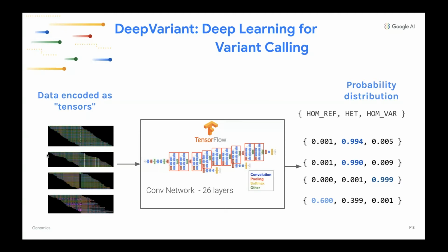and it takes not quite images of a genome browser, but things which are conceptually similar. So this is an ordering of genomic data with a left coordinate in the reference and a right coordinate in the reference. It's a composite of multiple channels: bases, qualities, mapping qualities, strands, and so on. So a human couldn't really meaningfully look at this data, but it's able to be processed in the same sort of architecture. And the output of this is a classification per position of those which are homozygous and match a reference, heterozygous, or homozygous to a variant position, as well as a confidence probability.